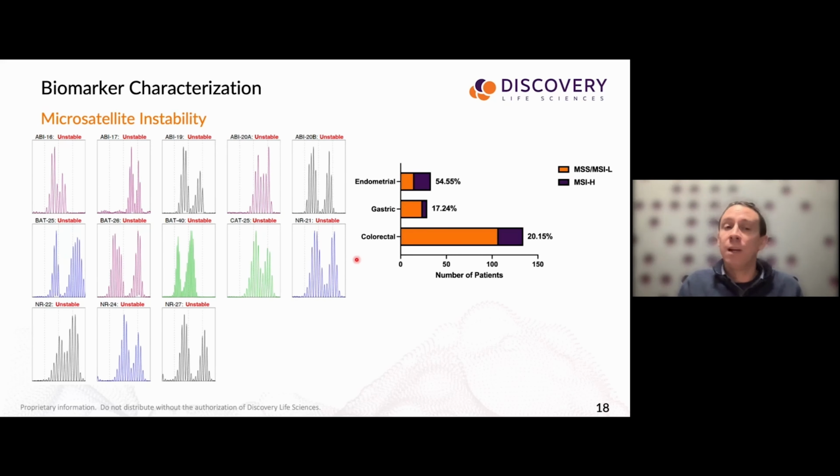And so now we have even an additional level of characterization on top of this where we can develop models based on genomic instability. At this point, we haven't evaluated tumor mutation burden. That is actually an active area of research as we explore more NGS-based screening routes. And that will be part of the additional characterization that we're going to have in the future.